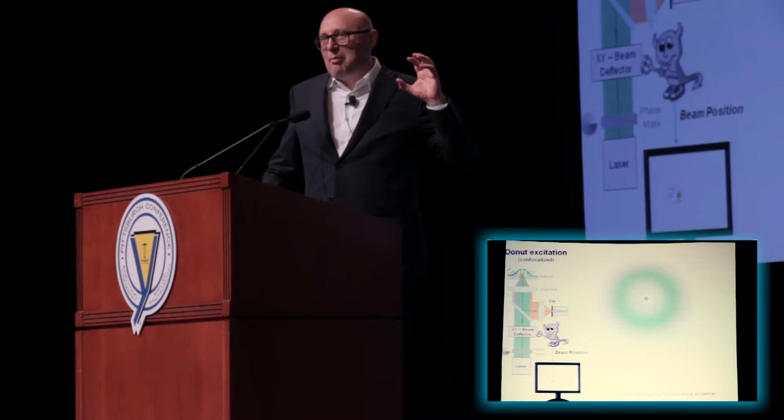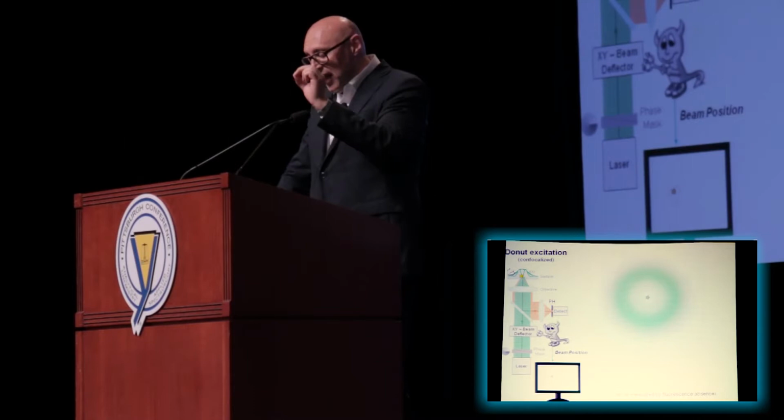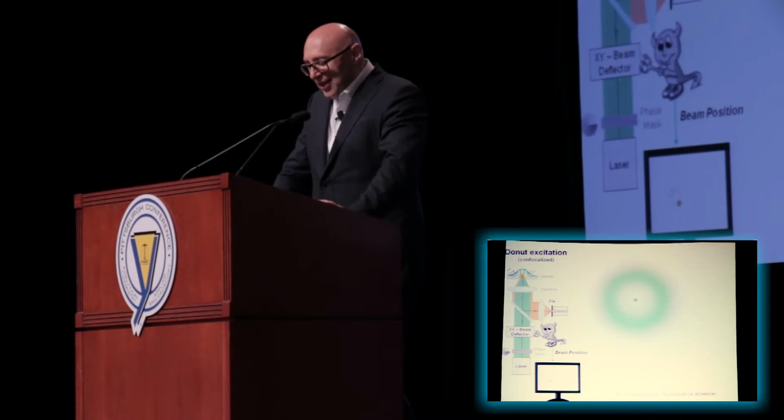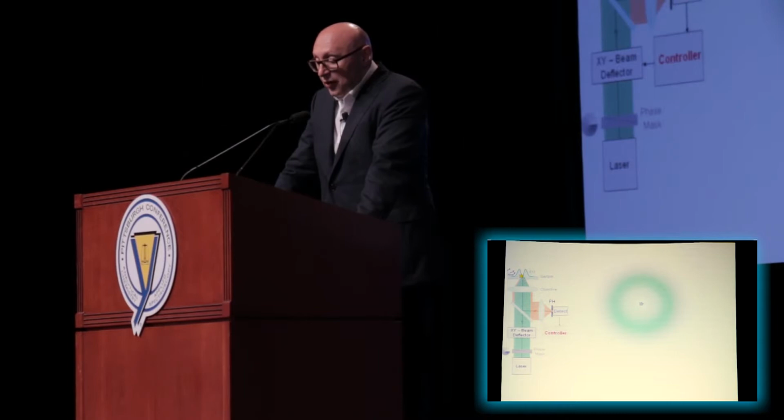The excitation photons determine the position in space, and then, of course, you get a well-defined coordinate, and so you do the localization actually, to a large extent, by the photons that come from the light source. And as I said, there are zillions of them. You're not limited in the number of photons that you have. Now, of course, there's no such thing as a demon, and even I cannot make one.